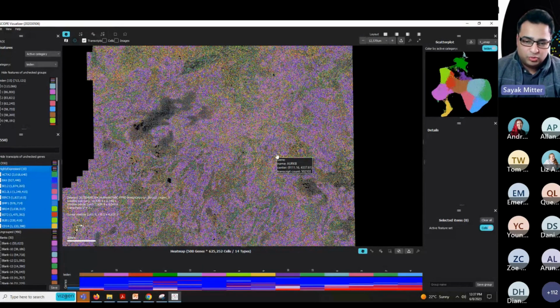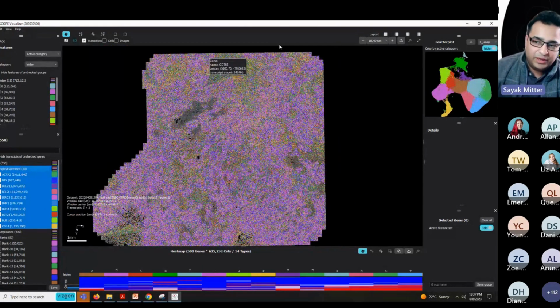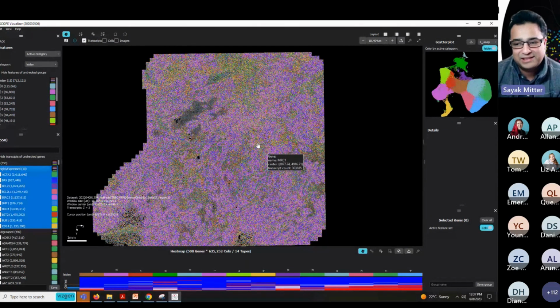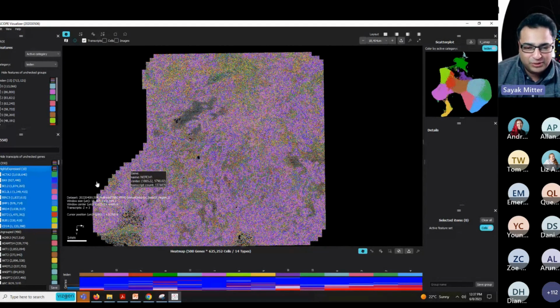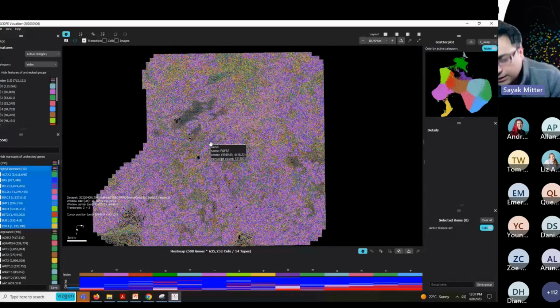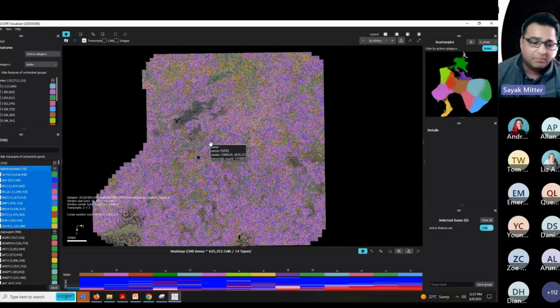Right. So to recapitulate so far, we've looked at the spatial window, we've looked at the settings, and we have now looked a little bit into the genes, and how to look at the spatial spread of the genes. And now, the next thing that I would like to show is the single cell clustering, helping with the visualizer. So the visualizer doesn't do single cell clustering within the software itself, but it plays very well with pipelines such as ScanPy.